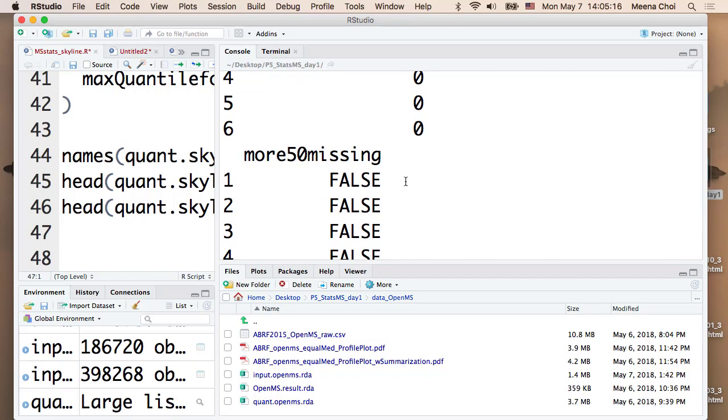So if I go back to one of the questions from the last section, if Tukey median, if you just put the 0 for missing value, like 10, 10, 0, 0, 0, 0, 0, what is the median? It's 0, right? So we should expect something between the 0 and the 10. So that's why we want to impute something instead of the 0.